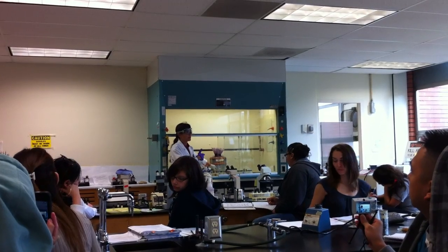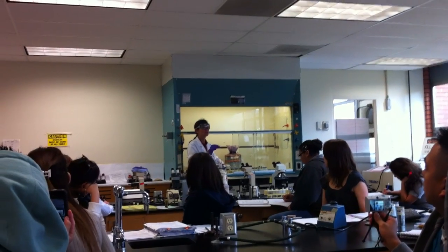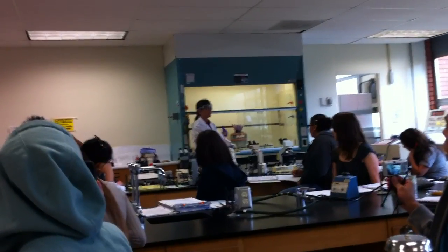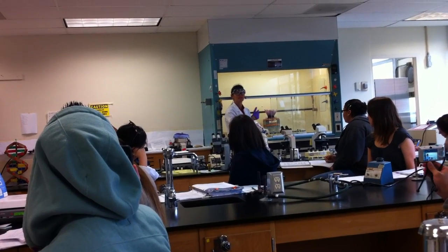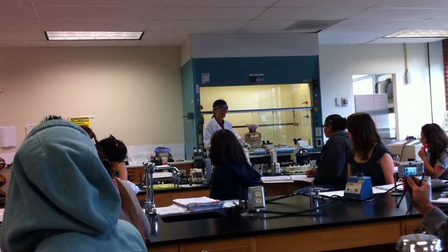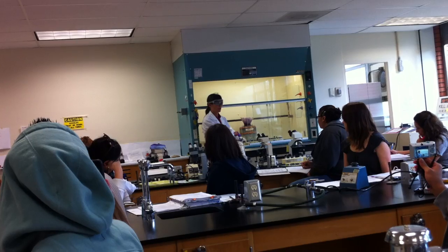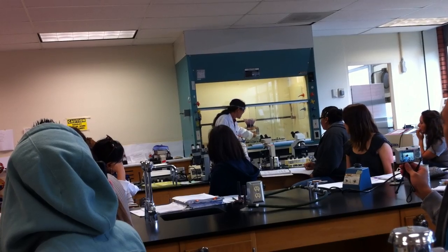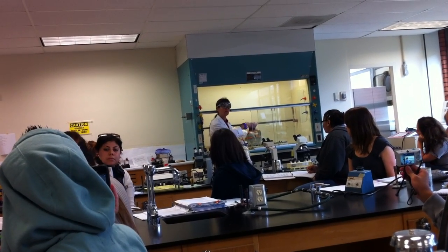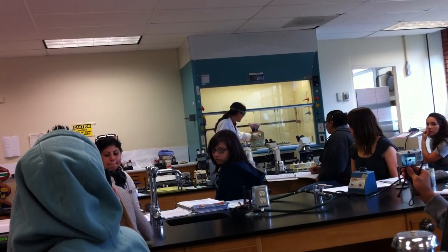Okay. Now here's the thing. Unfortunately the previous lab section didn't do this, but we really want to help the folks that are helping us. So please, before you leave today, make sure you take the tape off your tubes. We're going to leave them in the hood. The VP goes through chemical hazardous waste, but if we don't take the tapes off, it really takes hours for the folks that are helping us to take it off. So we want to help them, right? So don't do as the previous lab sections did and leave their tape on. That's not cool. So please just make sure you take your tape off before you leave today, okay? But leave them in the hood. Hazardous waste procedures.